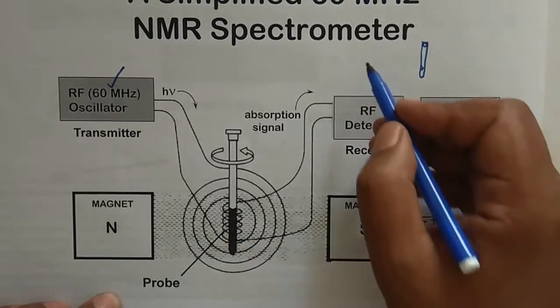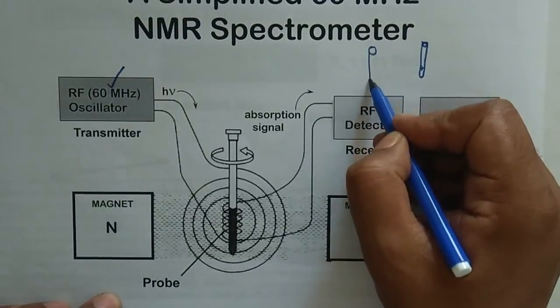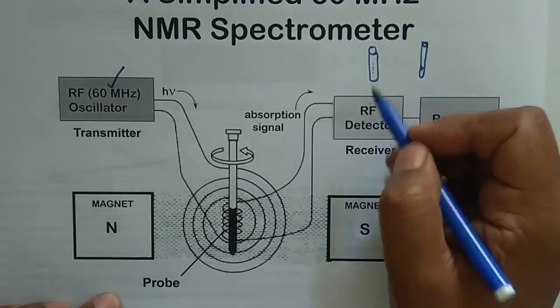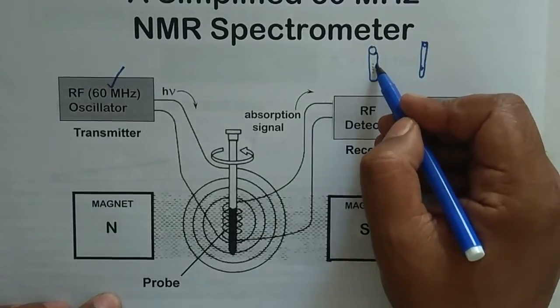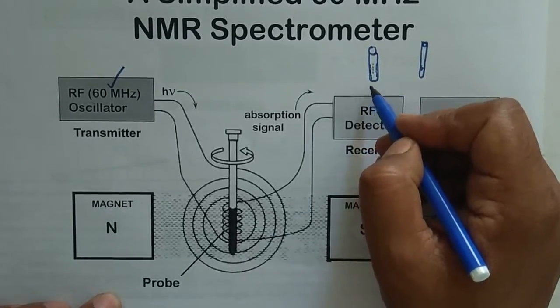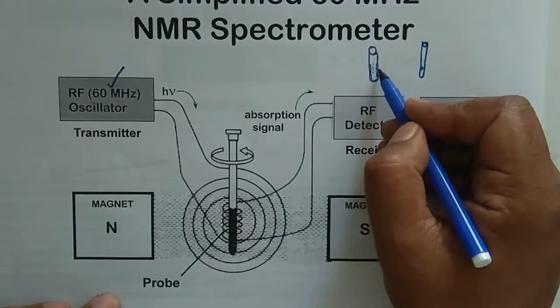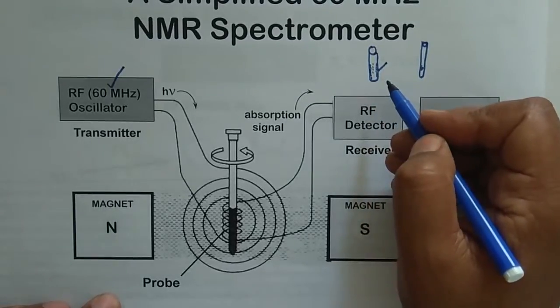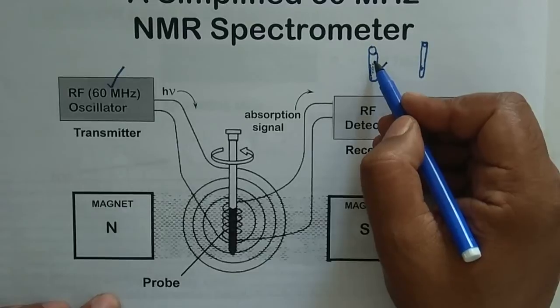Say for example, this is your NMR tube. Some molecules will be in the center of this tube and some molecules will be on the walls of the tube, and this is a very sensitive technique. So there may be a possibility that the molecules at the wall will experience a different magnetic field from those in the center.